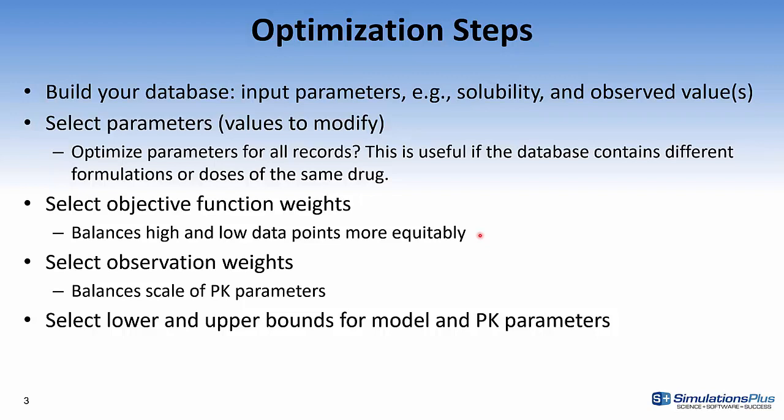The next thing to select is your observation weights. Different observations can be weighted differently. For example, you could weight the oral bioavailability differently than the Cmax. And then the final step is to select lower and upper bounds for the parameters that will be optimized and also the PK parameters.